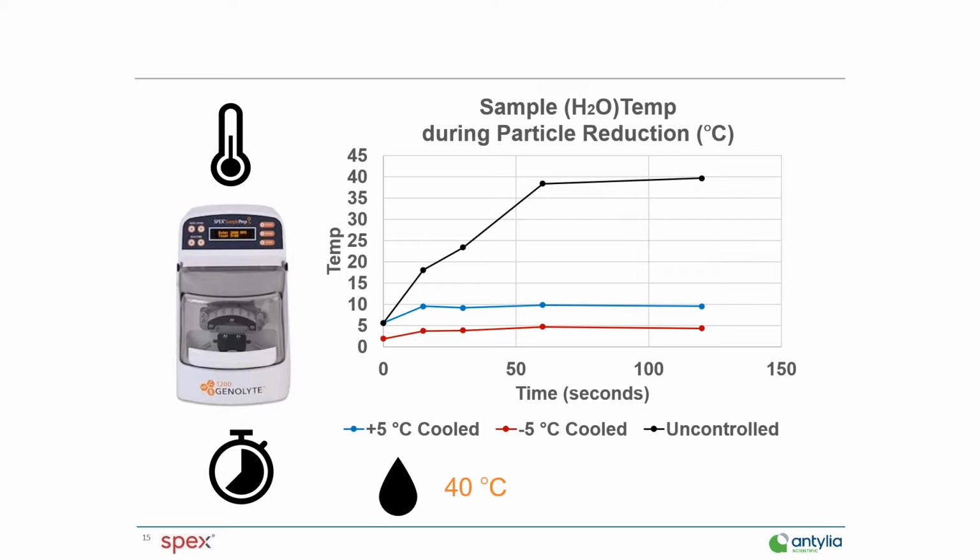Now, 40 degrees C, that was just for water. But if you imagine you have a more fibrous tissue, or a tissue that's going to generate a little bit more energy as friction is involved, you are very quickly going to start to have to worry about your temperature.